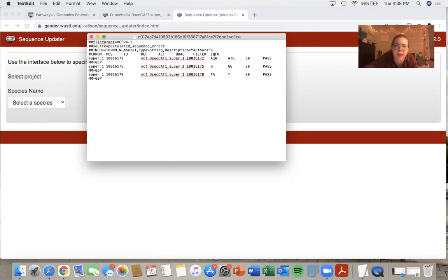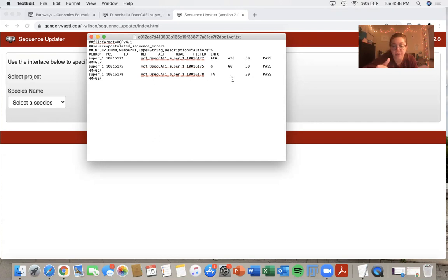So the first one you can see ATA to ATG, that's my change of base. The G to GG, that was my insertion. The TA to T, that was my deletion.